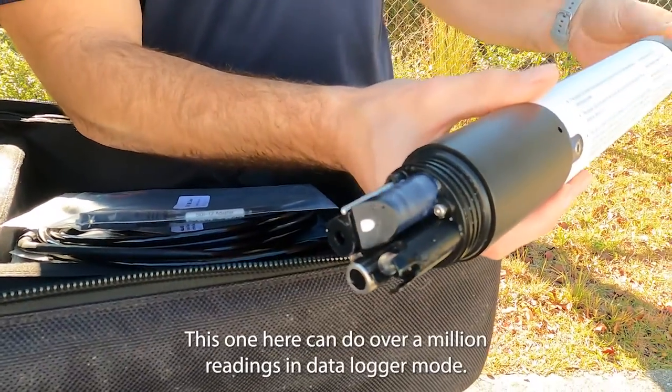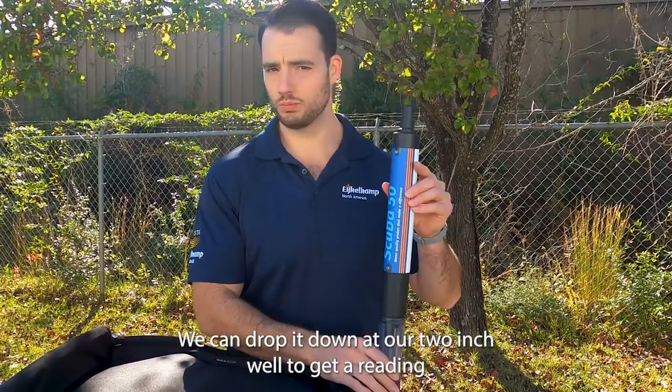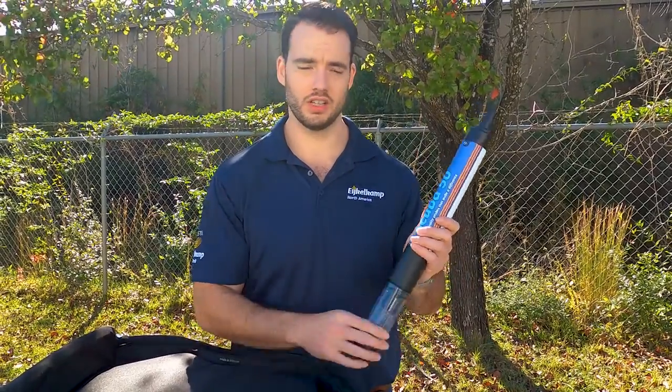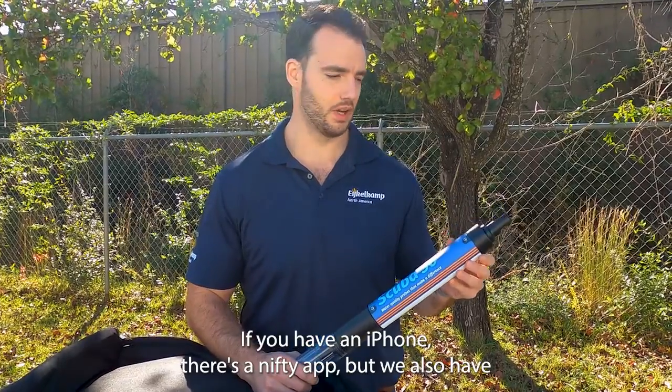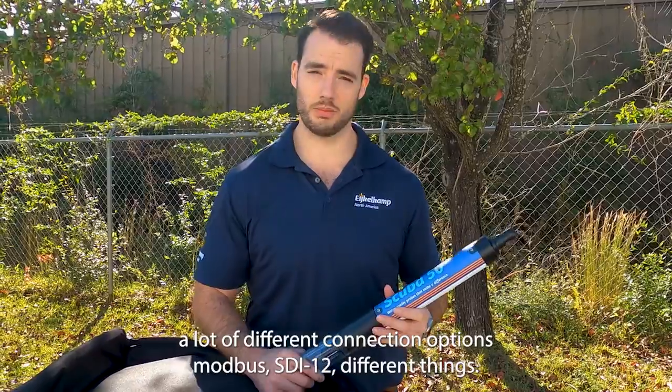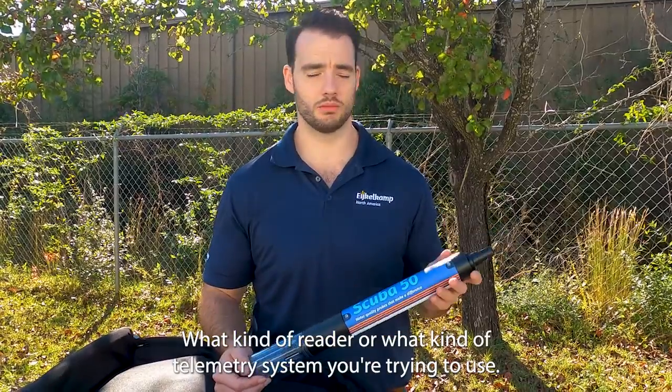This one can do over a million readings in data log remote. We can drop it down a two-inch well to get a reading with a Bluetooth connection to our phone — there's an iPhone app. We also have a lot of different connection options: Modbus, SDI-12, and different options depending on what kind of reader or telemetry system you're using.